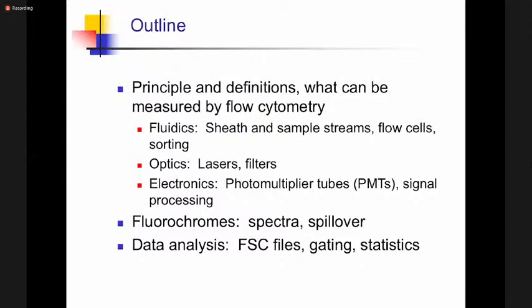Then you go to that analysis where you have the flow cytometry files, and you check what the population of these cells is, which are spread much more to the left, and which are spread much more to the right. We'll see all that when we talk about the scattering of cells. Hence, the term gating.